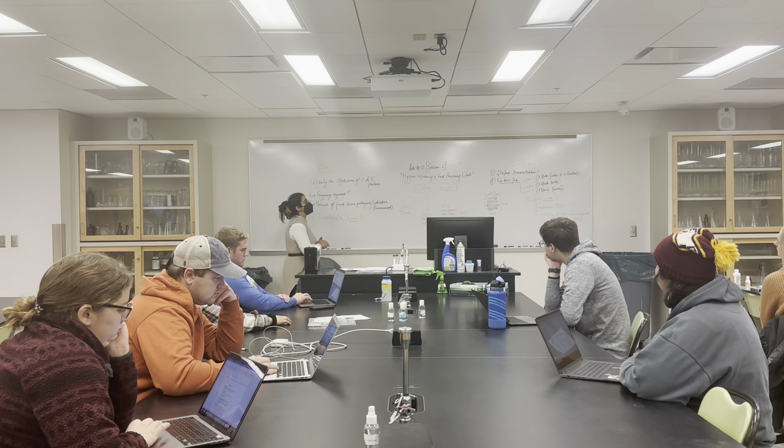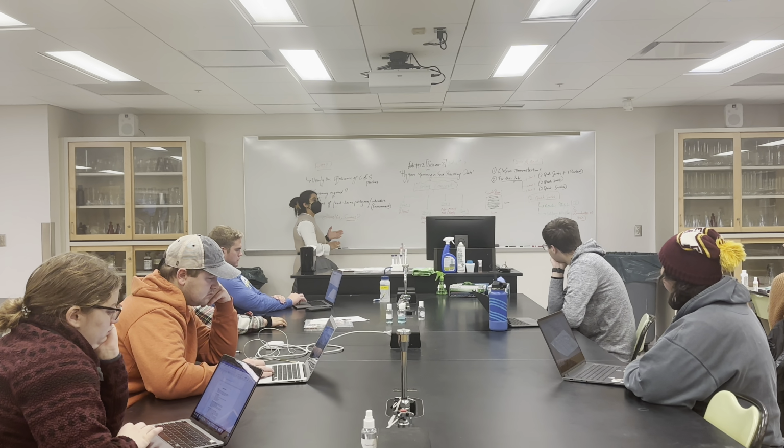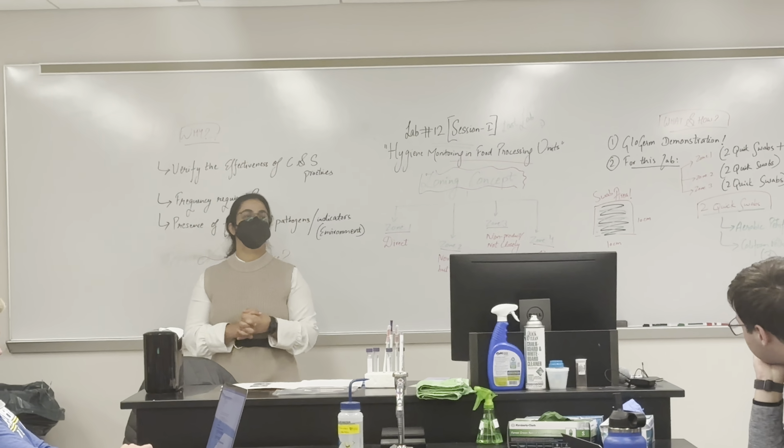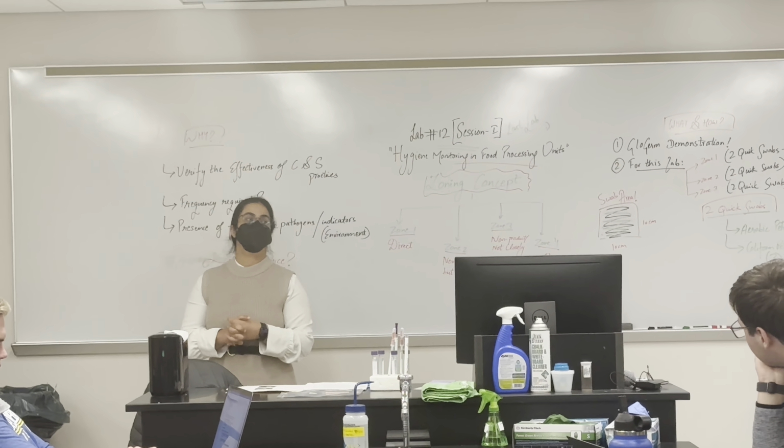2011, which is Lab 12, Session 1. So today's lab is about hygiene monitoring in food processing units. So the first question that comes is, why do we need hygiene monitoring design in food processing units?